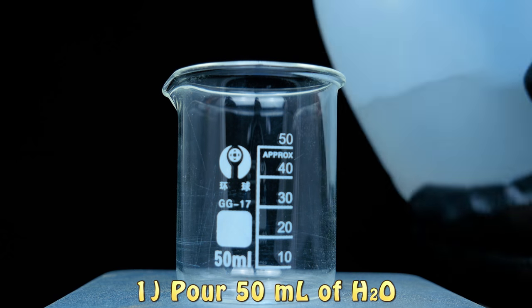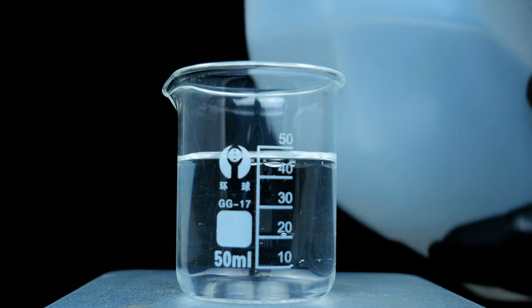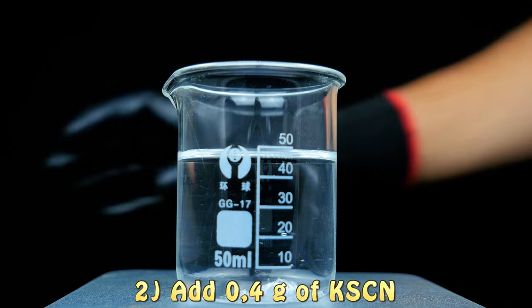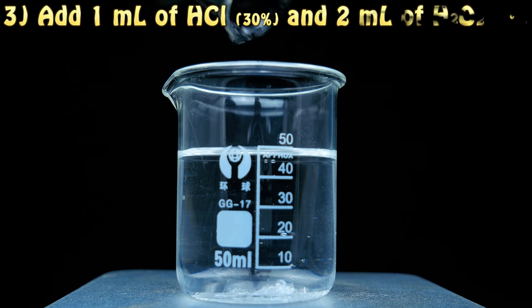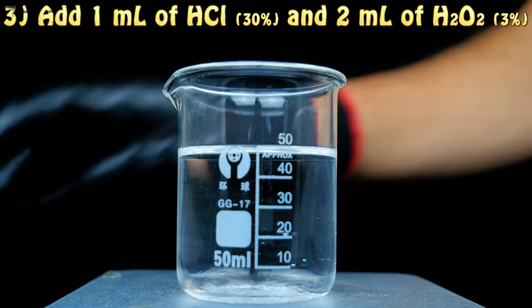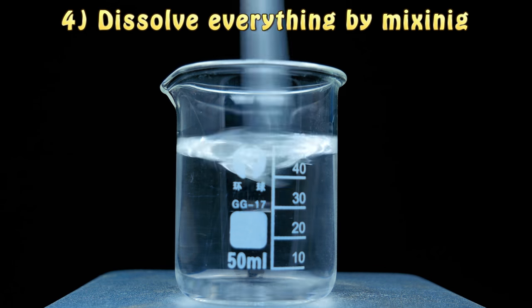The procedure for the experiment begins by pouring 50ml of water into an appropriate beaker. To this beaker we are going to add three substances: the first is potassium thiocyanate, of which we are going to add 0.4 grams. Then we are going to add 2ml of hydrogen peroxide concentrated at 3% and 1ml of hydrochloric acid concentrated at 30%.